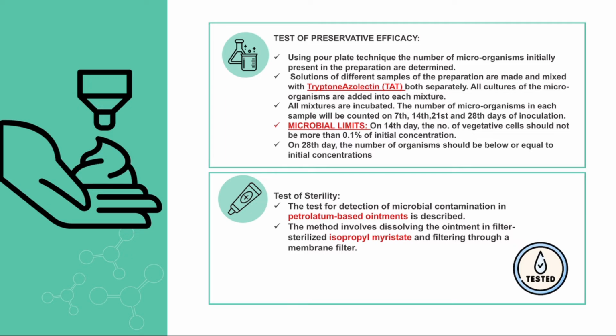So, semi-solid preparation must be evaluated and tested to avoid any problems such as irritancy, poor absorption, or penetration, and to ensure safety and quality of all material. Quality control personnel should apply each test to get high quality and efficiency for each semi-solid preparation.